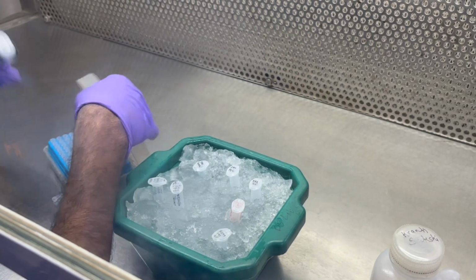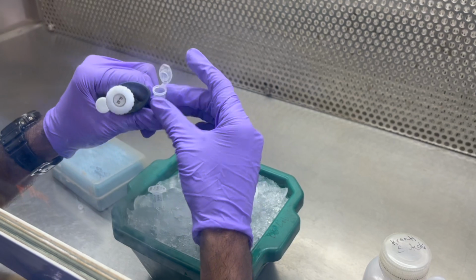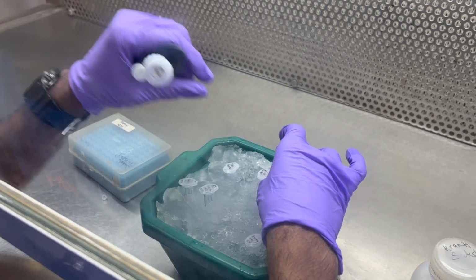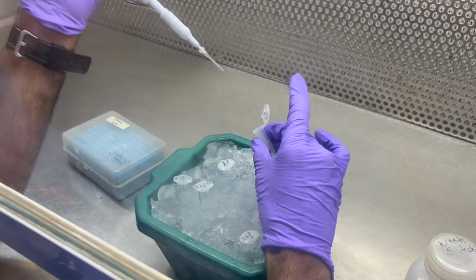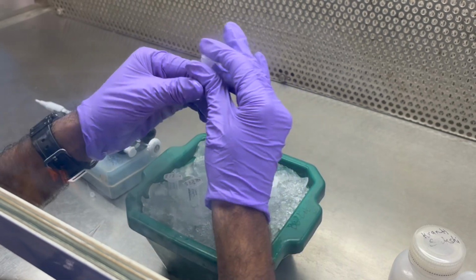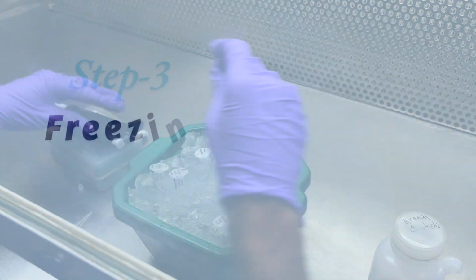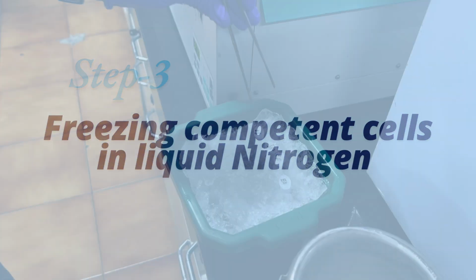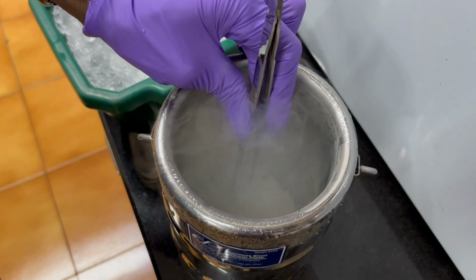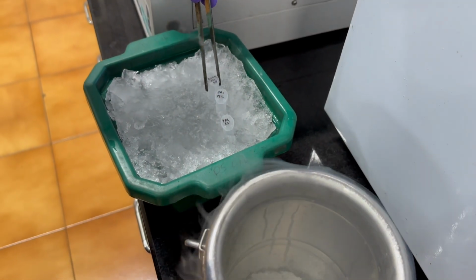And after adding the plasmid, you just gently flick the tubes and keep them on ice for at least 5 to 10 minutes. After incubation on ice for 5 minutes, we need to freeze the cells in liquid nitrogen for 5 minutes.